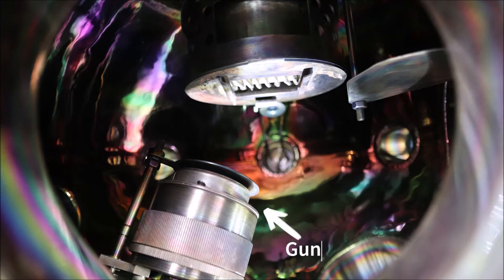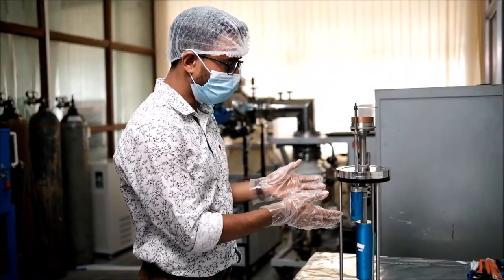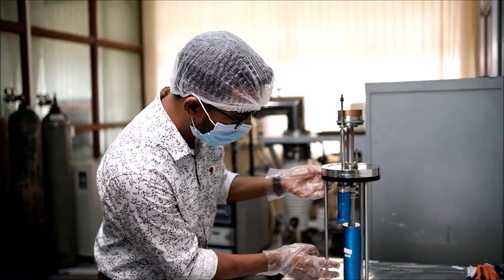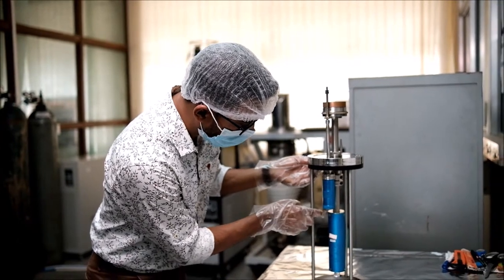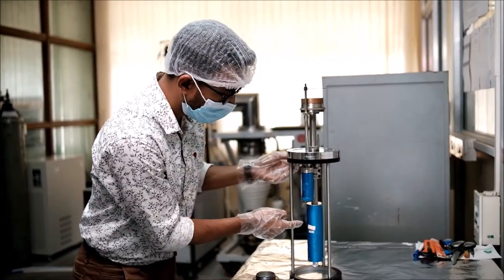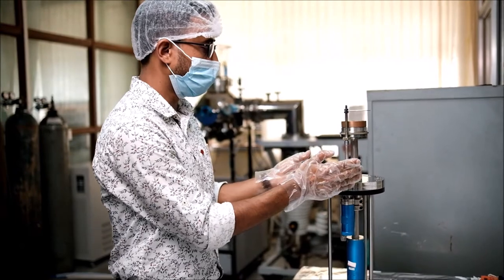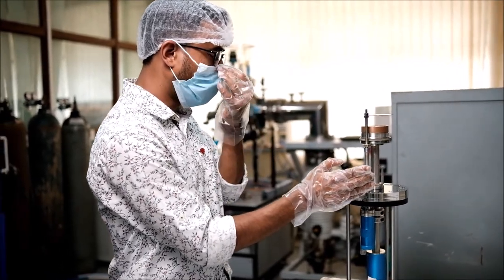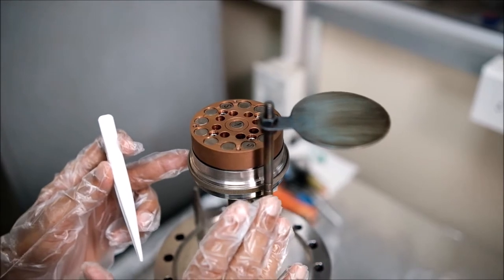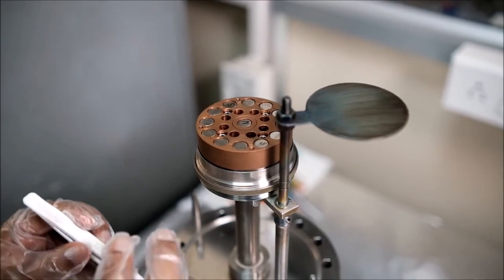We will see the inside part of the gun shortly to understand how the connection is made. This is the complete gun — this part is kept outside of the chamber as we saw earlier. There is also a scale which measures the substrate-to-target distance. With the help of this screw, we can maintain the distance at our required position. This is the part that stays inside the chamber. I have kept all the parts open to show you the inside.